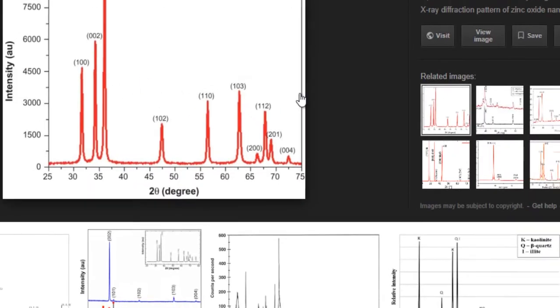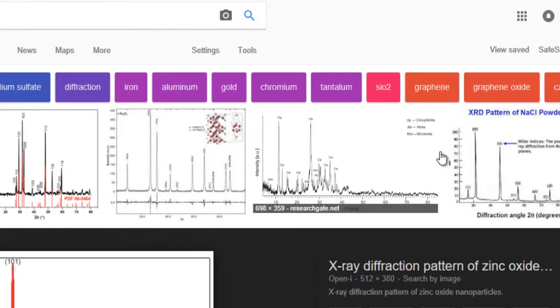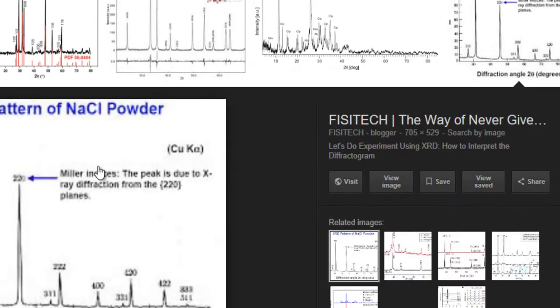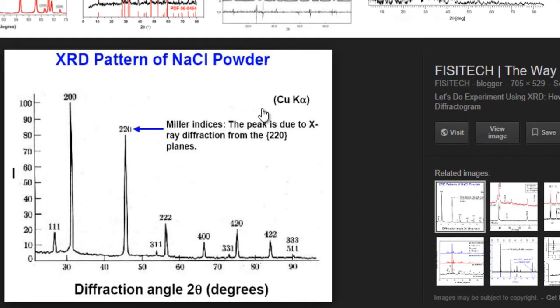We have a ZnO nanoparticle XRD pattern, another XRD pattern for NaCl powder. Typically what you have is the diffraction angle 2θ in degrees on the x-axis and intensity in arbitrary units on the y-axis.